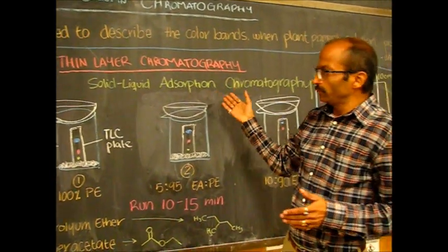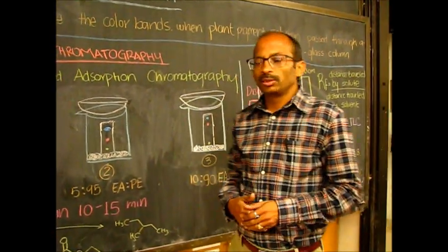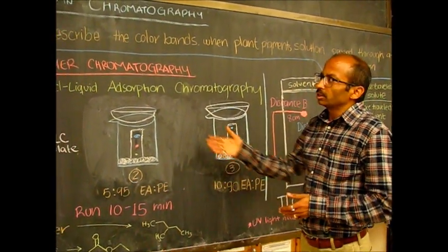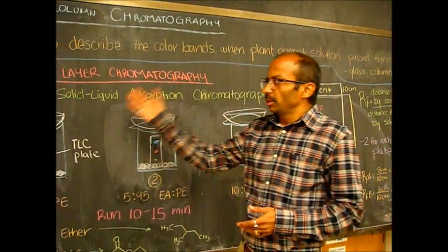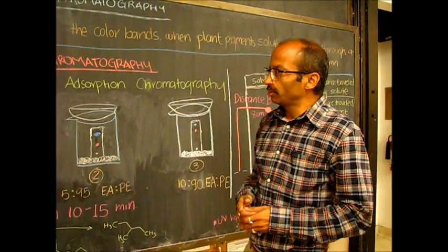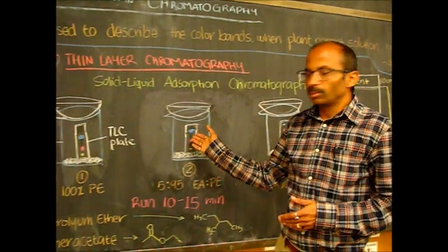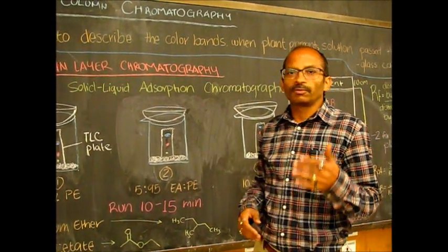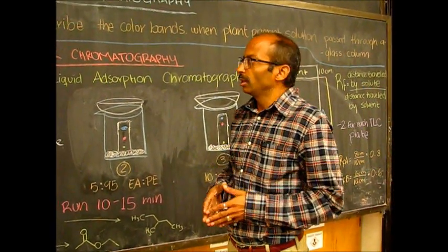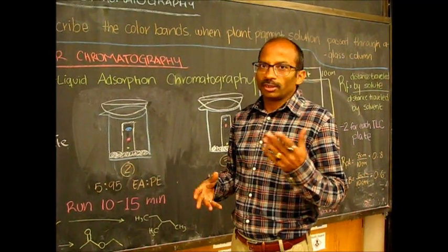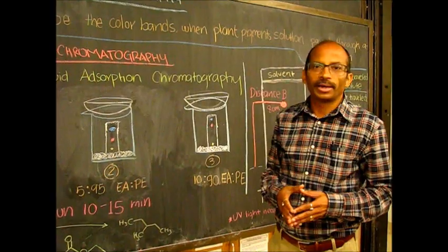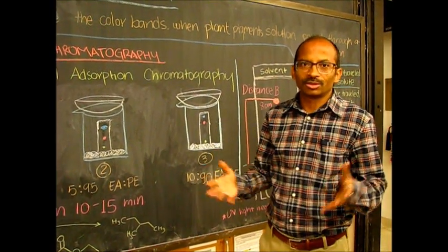In this experiment we will run the TLC of two compounds, one is nonpolar and one is polar. This technique is used to see the polarity and to calculate the RF of the compounds in different polar solvents. This technique is also used for purification of compounds and monitoring of chemical reactions. You will learn a lot from this technique about the polarity of compounds.